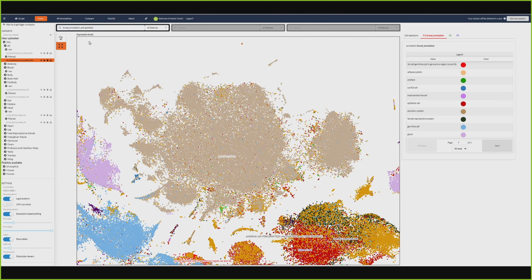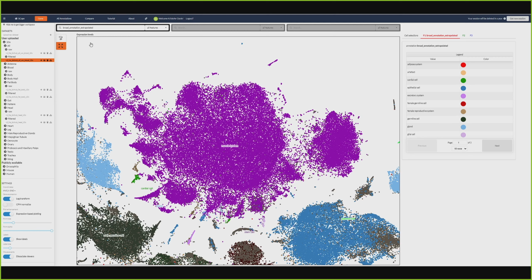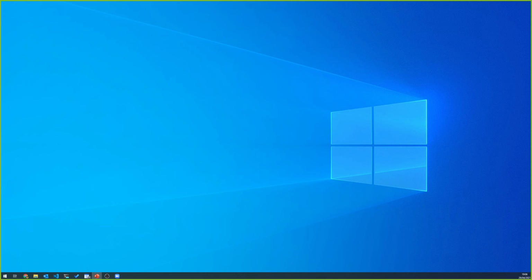And then if we go to the broad annotation extrapolated, this is where the all data set has actually been performed a high resolution clustering at 8.0, and we have assigned all cells from each cluster to the most represented, i.e. more than 20%, broad annotation. Some manual annotation was done in case a cluster didn't pass a certain criteria, but this gives you a broader and, as I mentioned, extrapolated analysis. And you can see some of these smaller clusters with different colors around the muscle systems.